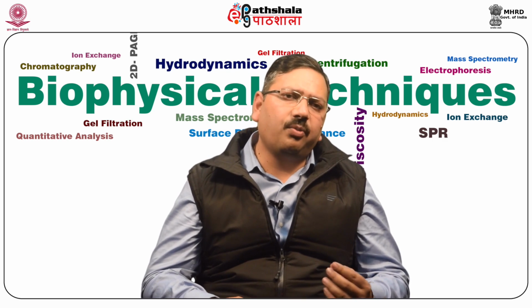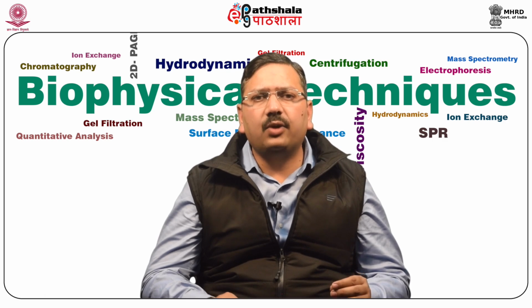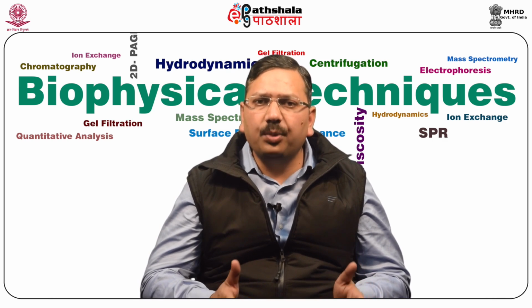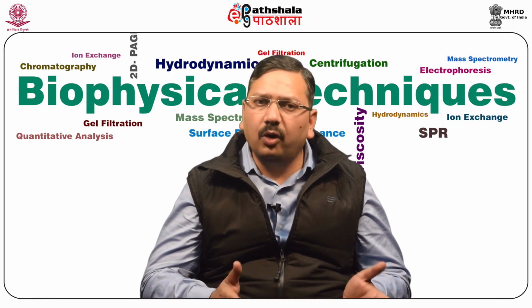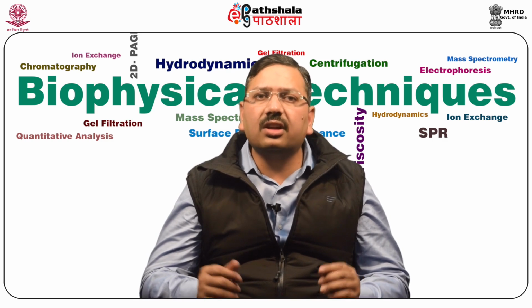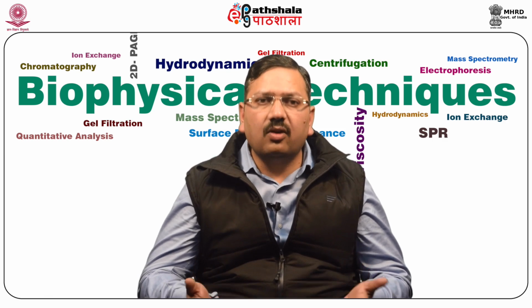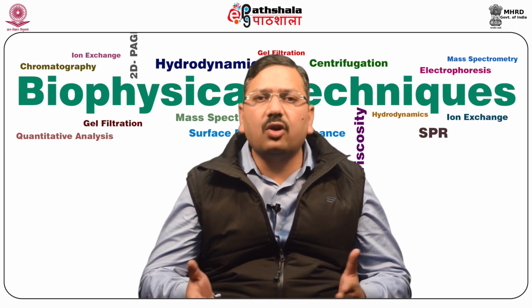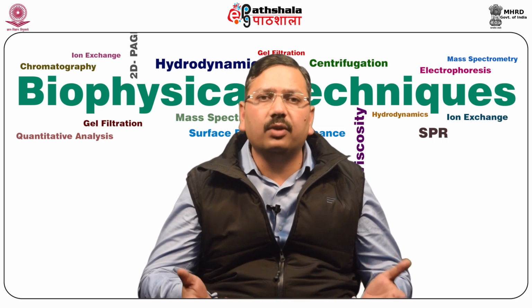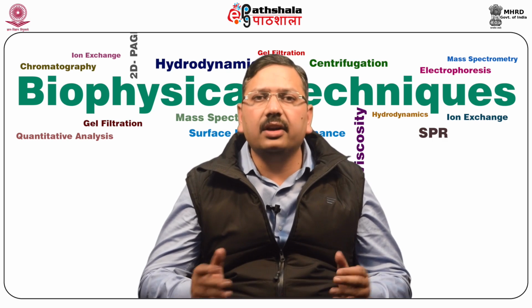Broad applications of mass spectrometry. Actually, mass spectrometry can be applied for qualitative and quantitative analysis. It can provide information about the mass of the atoms and the molecules which are present in a substance. It can also tell you the molecular structure determination, whether it's organic or inorganic. And nowadays you will find the identification and characterization of biomaterials or biomolecules are also associated with mass spectrometry. And these techniques involve the proteomic analysis, which will be covered in different sections.